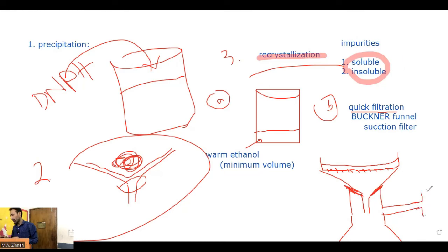This terminal is something connected like this. Now there is a water pipe, maybe this is the tap water. When you open the tap, water will come in, right? This water will come here, to be connected here. So water flows downward. Water always flows downward, understand?